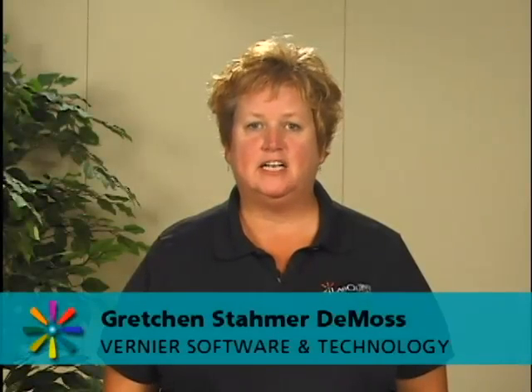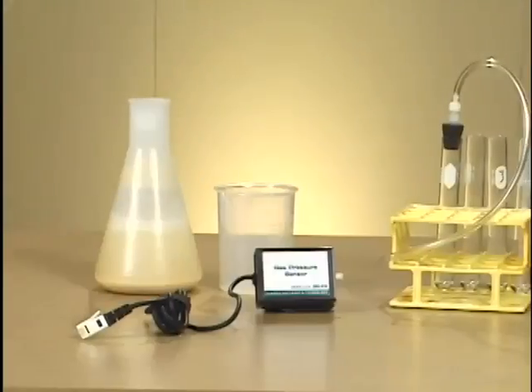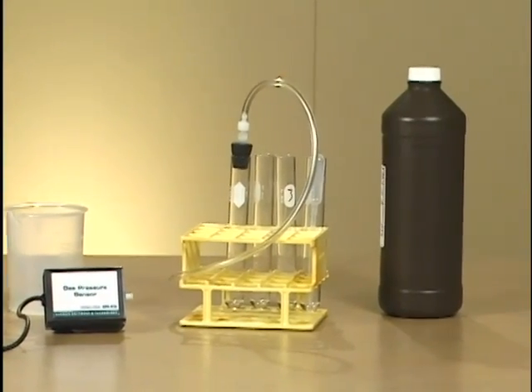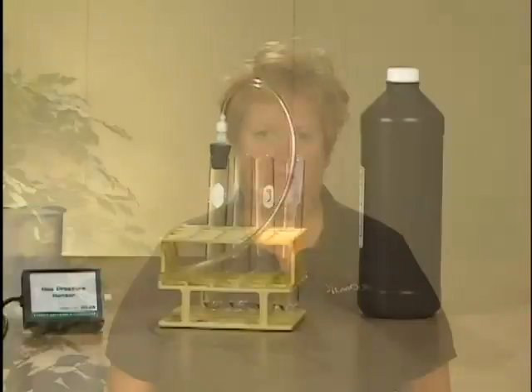This is the Enzyme Action Testing Catalase Activity from the Biology with Vernier and the Advanced Biology with Vernier Lab Manuals. This is a very popular lab for general biology and is one of the required labs for AP Biology.